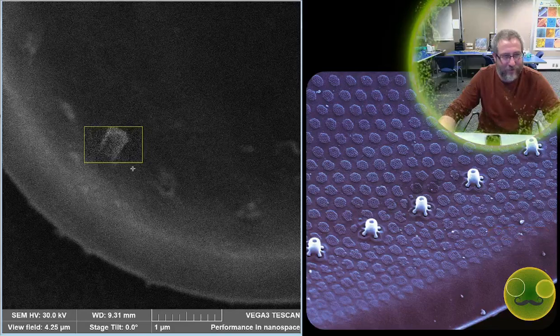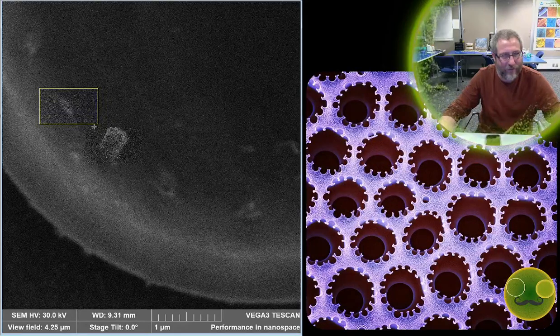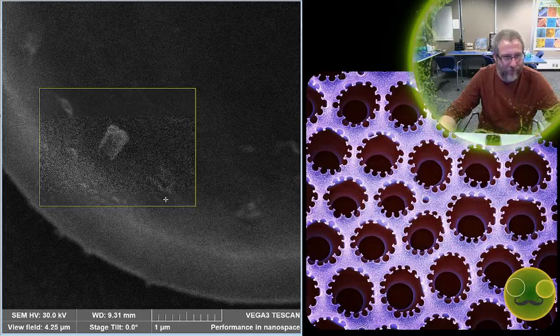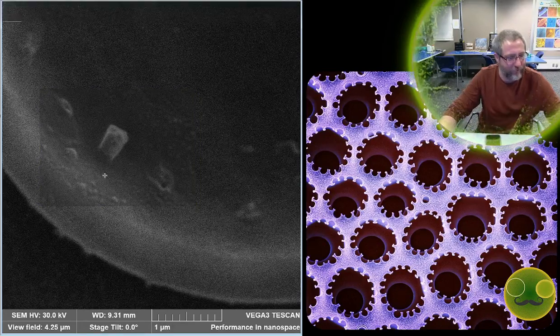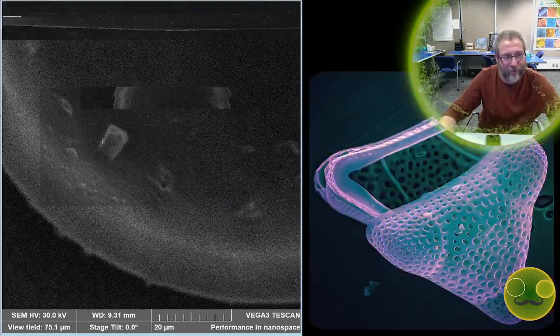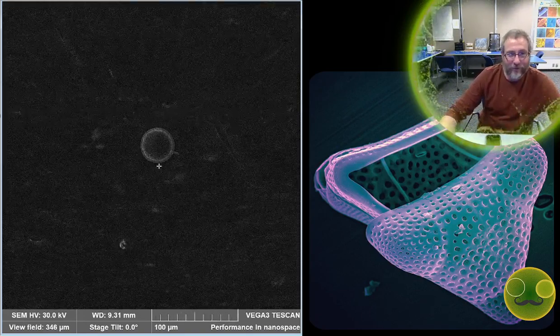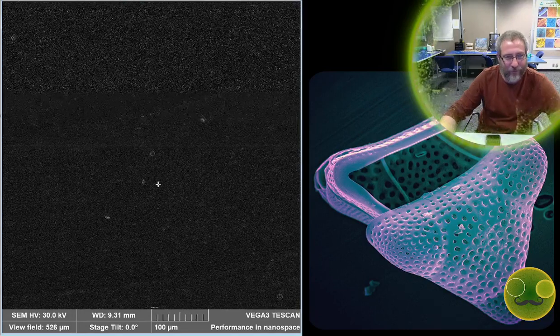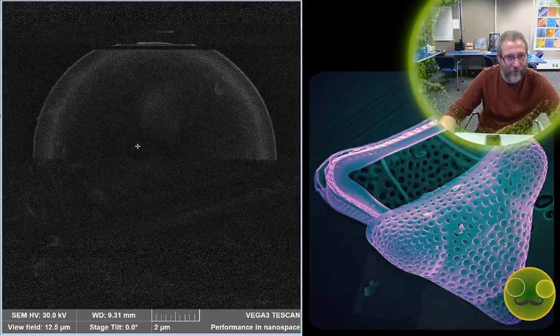I don't know if this rimoportula is any better than the last one. Just gonna slow it down and see if I can see any more detail. You can just barely see there's a line in there, but it's a bit of an imagination line, in my opinion. You can't really see it cleanly, and I think if I changed the settings so it was on the finest magnification, we probably could. But I'm not that excited about a line through a process. I know where it is, and I think Andy would know where it is if I sent him pictures.